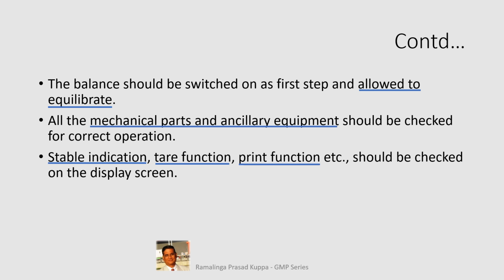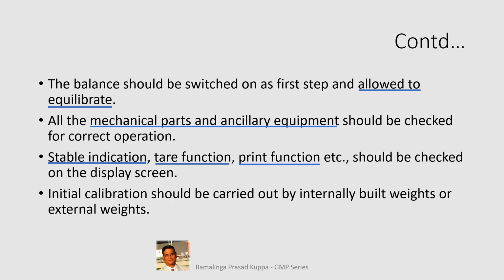The display should be stable within a few seconds. For the printer, it is recommended to use an ink printer and not a thermal printer. Information on a thermal printer does not last long. After a few days, the print data disappears from the printed slip.